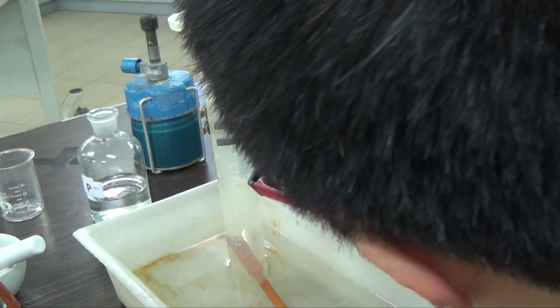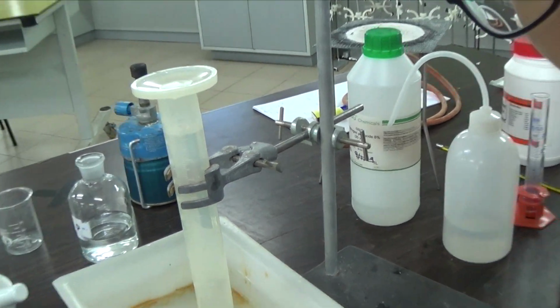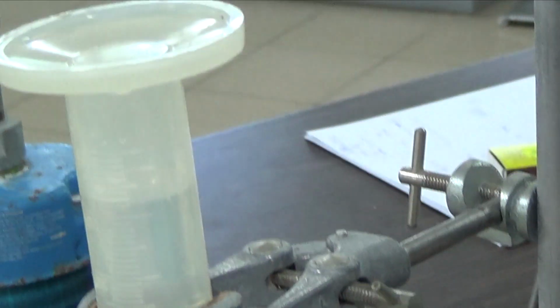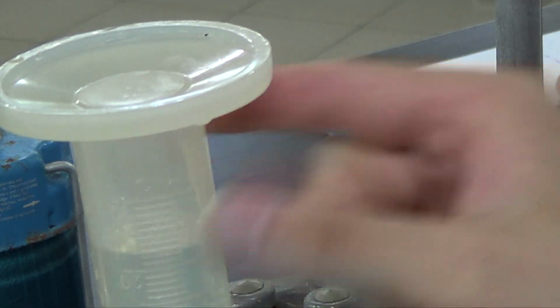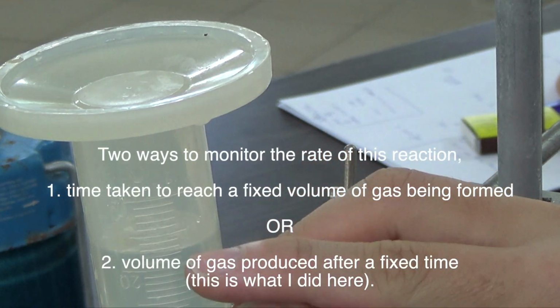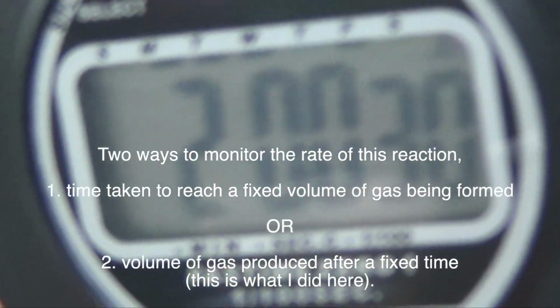So there's 15, 16, 17. I'm just going to remove that, and then I will bring that closer. Let me see. Can I bring it closer? Maybe, maybe not. So there's 0, there's 10, and then there is 15, 16, 17, 18. 18 cm cube in 2 minutes. You got 18 cm cube of gas in 2 minutes.